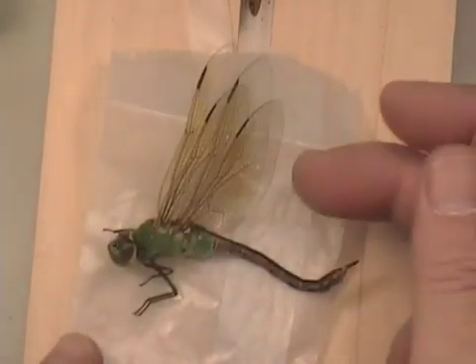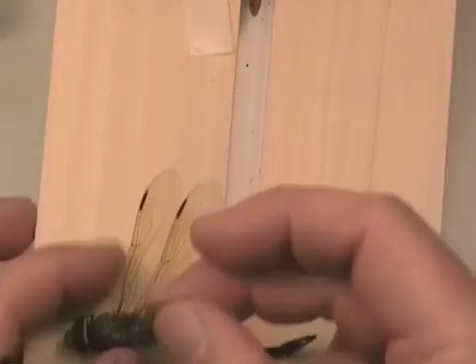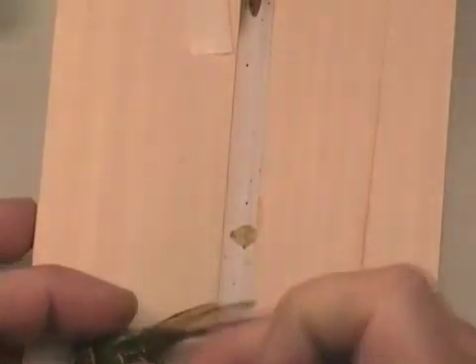Here's a dragonfly that was collected today in a butterfly envelope, and now we are going to spread it. It is one of the darners in the family Eshnidae.